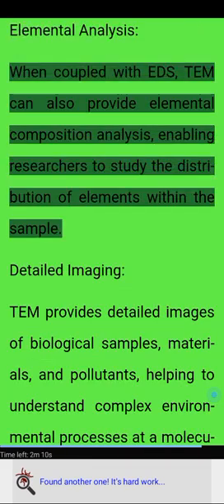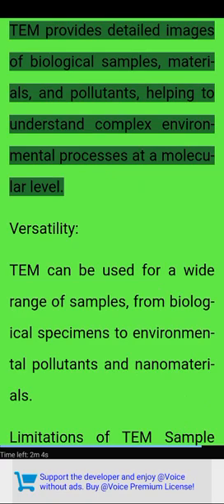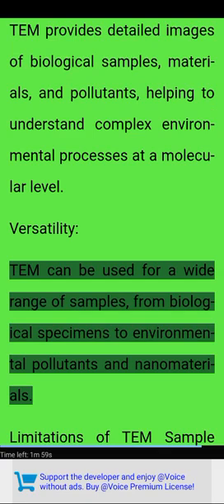Elemental analysis. When coupled with EDS, TEM can also provide elemental composition analysis, enabling researchers to study the distribution of elements within the sample. Detailed imaging. TEM provides detailed images of biological samples, materials, and pollutants, helping to understand complex environmental processes at a molecular level. Versatility. TEM can be used for a wide range of samples, from biological specimens to environmental pollutants and nanomaterials.